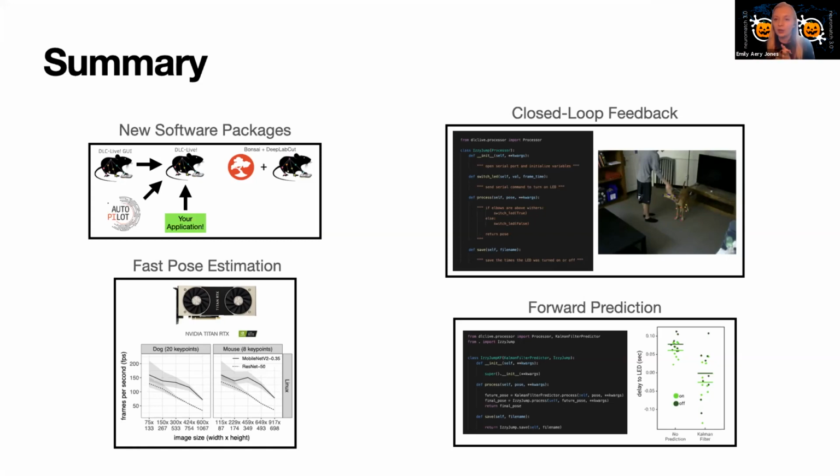Great talk. For more complex behaviors, there are a number of options for ethogram identification. Can you speak to how or if ethograms could be incorporated into DLC-Live?